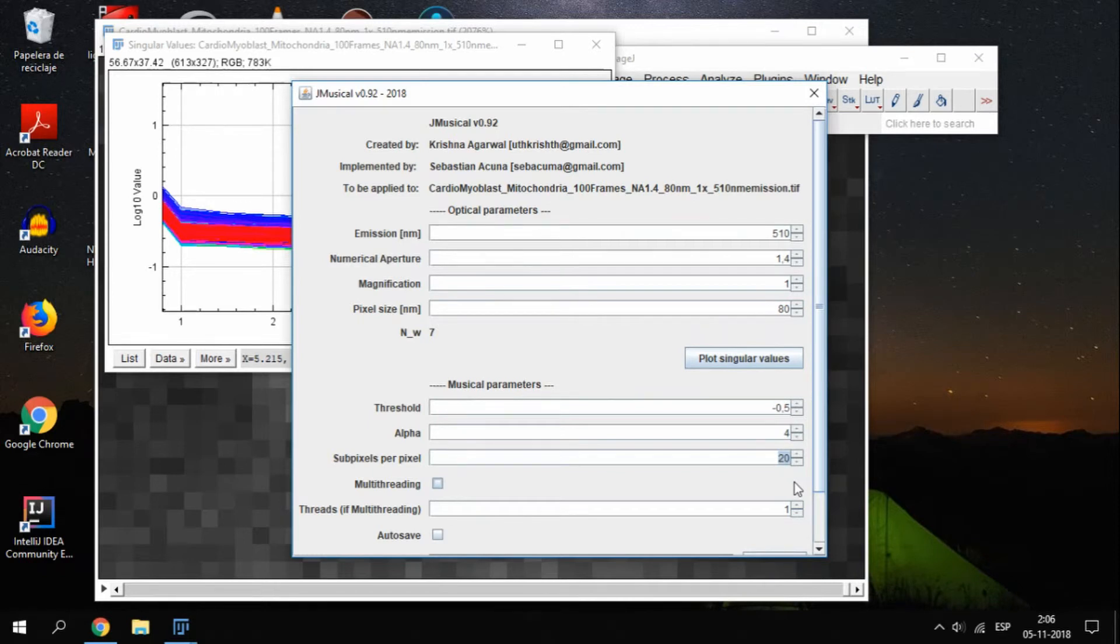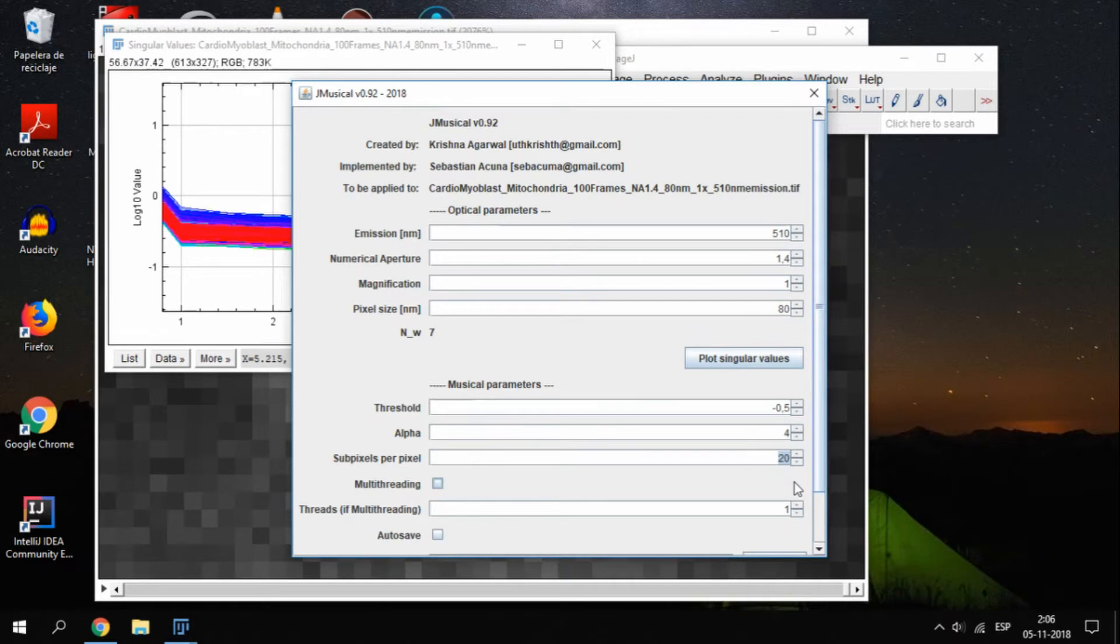Finally, we set how many subpixels we want to grid along each side of each original pixel. For instance, if we pick 20, for each pixel in the original image, we will create a grid of 20 by 20 pixels. This means that the final image will have 20 times the width and height in pixels, and that the new pixels are going to be 20 times smaller than the original ones.